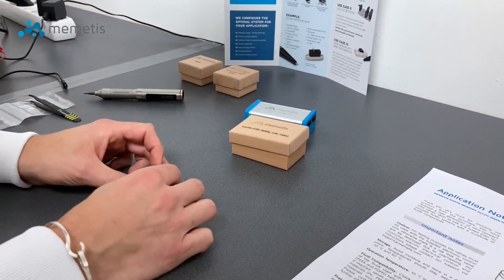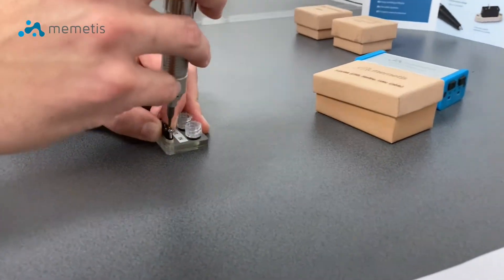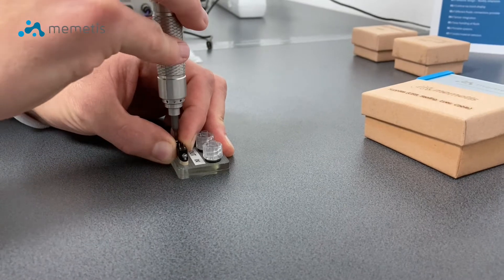Next, the valve is installed on the fluidic connector block while making sure the inlet and outlet properly fit to the fluidic connector.